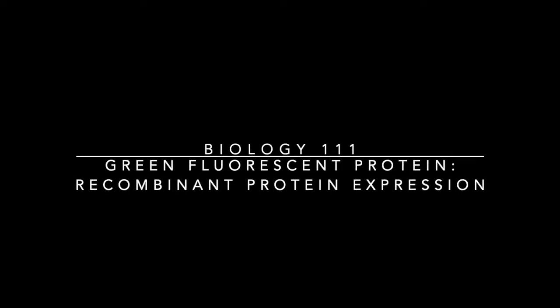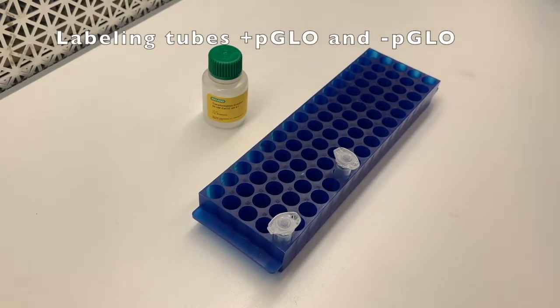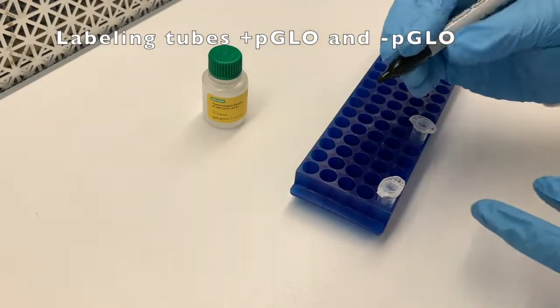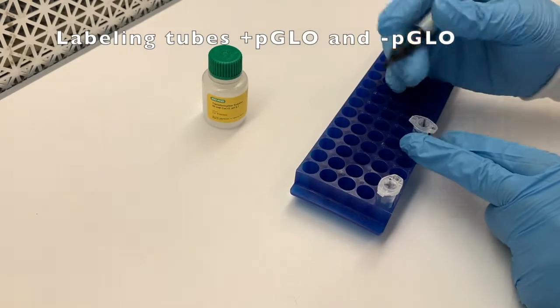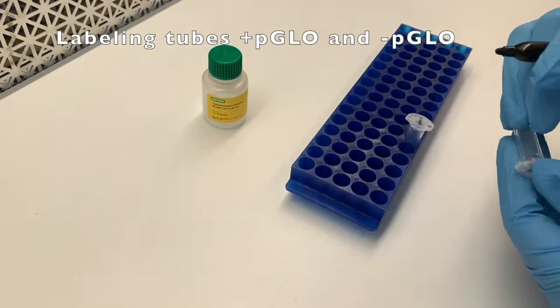Today I'd like to take you through some of the most important steps in the Green Fluorescent Protein Transformation Lab. First thing, you want to label your tubes — plus and minus pGLO — whether it's going to get the plasmid or not. That'll set you up for your future experiments.